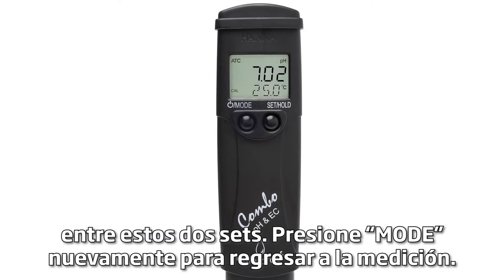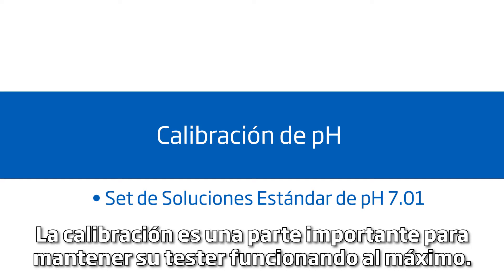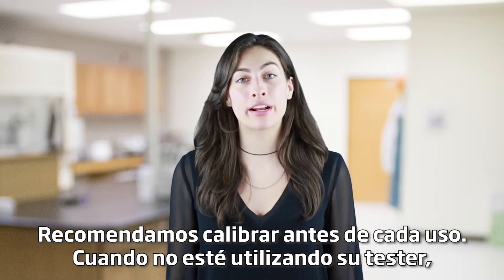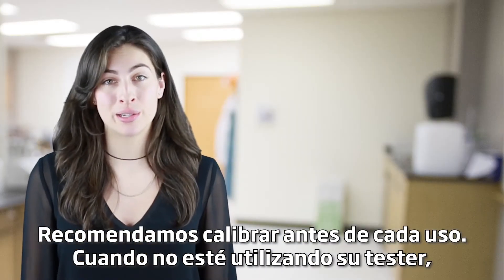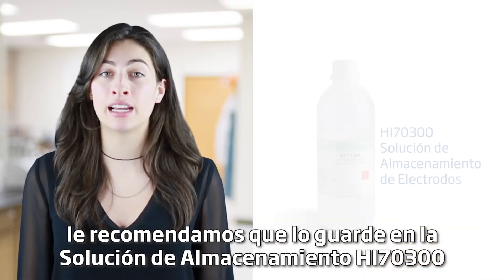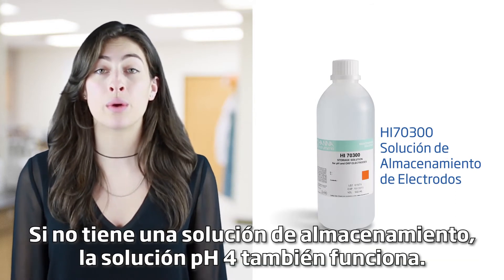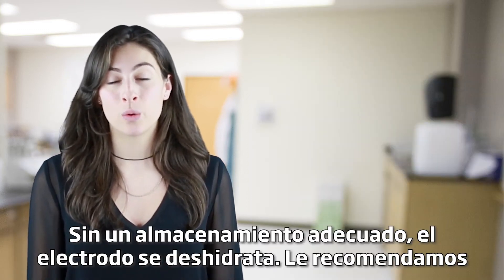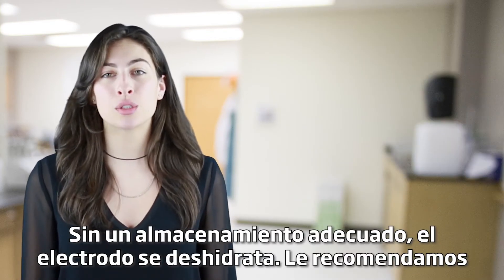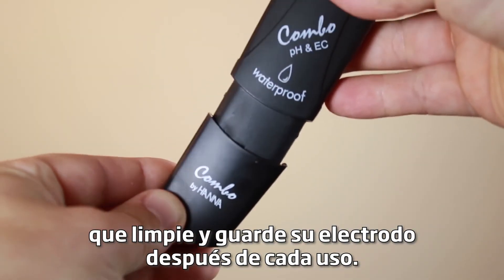Pressing MODE again takes you back to measurement mode. Calibration is an important part of keeping your tester operating at its best. We recommend calibrating before each use. When you're not using your tester, we recommend you keep it in the HANA HI70300 storage solution. If you don't have storage solution, pH 4 buffer works too. Without proper storage, the electrode gets dehydrated. We recommend you clean and store your electrode after every use.